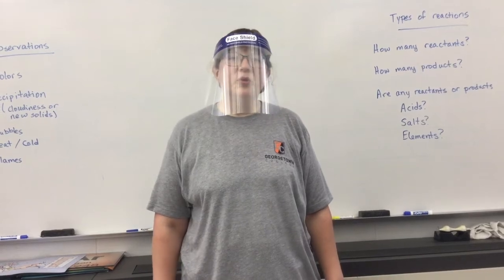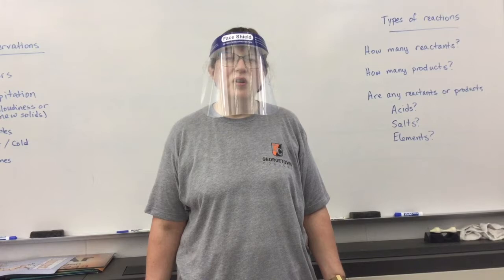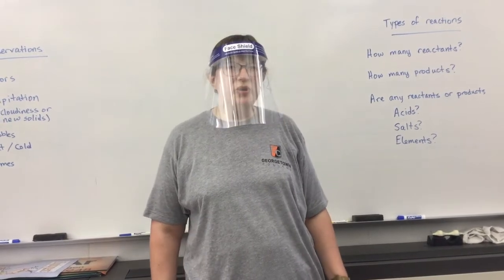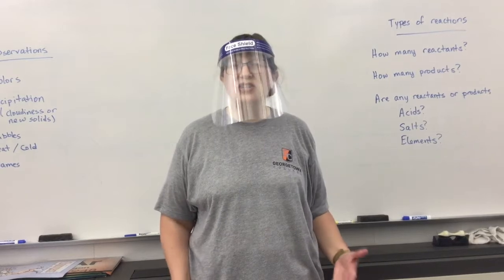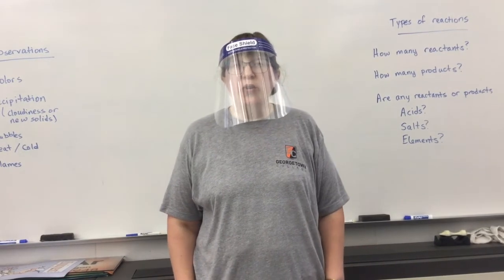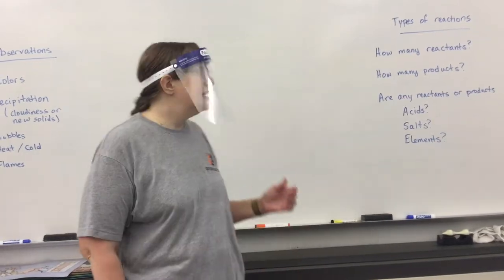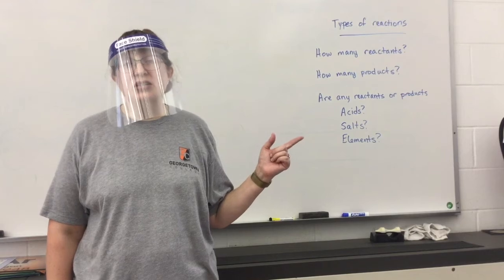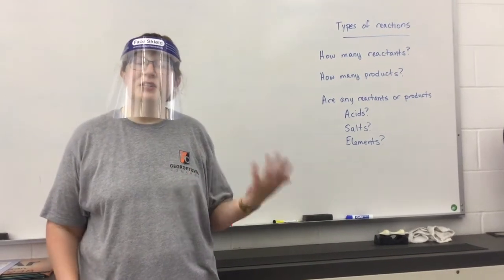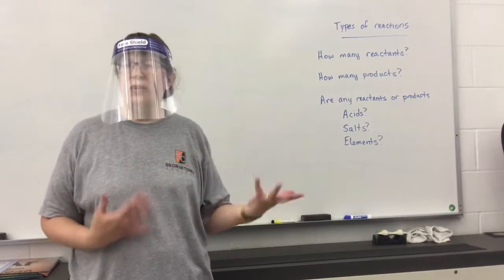In this week's lab, you're going to be looking at a variety of reactions, some of which you've seen before. This time we're going to try and put the reactions into balanced equations and to determine what type of reaction they are. So when you're looking at the types of reactions, you're going to want to pay attention to a few things. It's important to understand how many reactants and how many products you have, because if you have a decomposition or a synthesis reaction, there will only be one of those things.